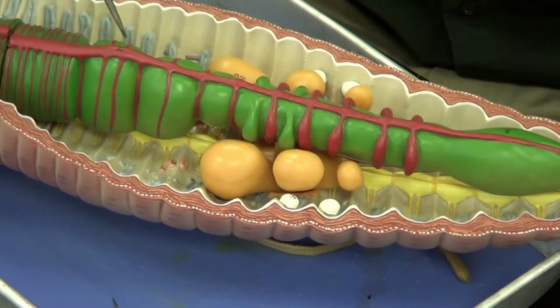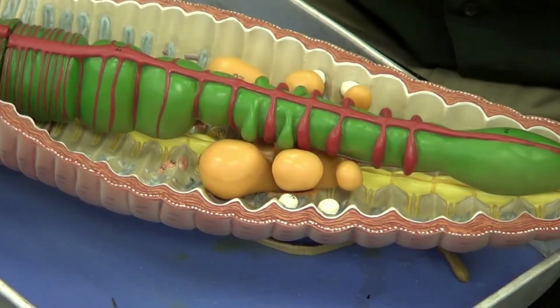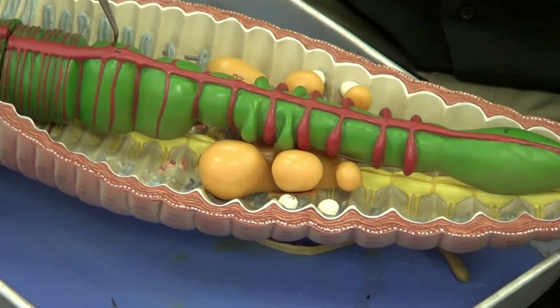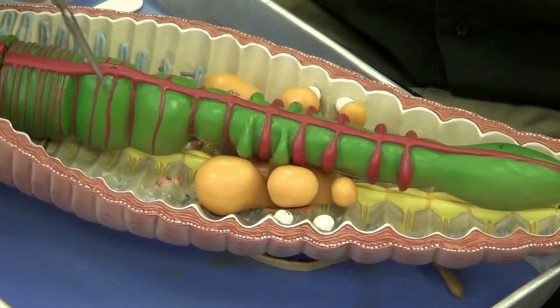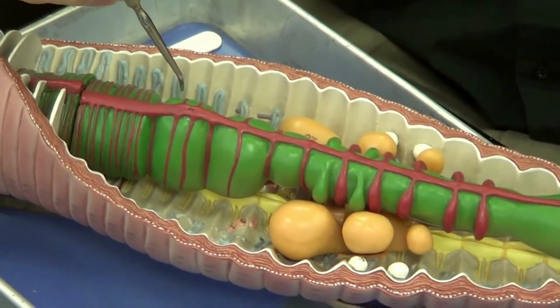The gizzard is a very muscular organ, so if you push on it with a probe, you'll feel the resistance of all that muscle. And it's muscular because it digests and grinds the food. So the gizzard is going to do two things. It's going to release digestive enzymes, and it's going to grind the food up. It's going to mix the soil up with the small bits of organic material that this earthworm wants to digest.